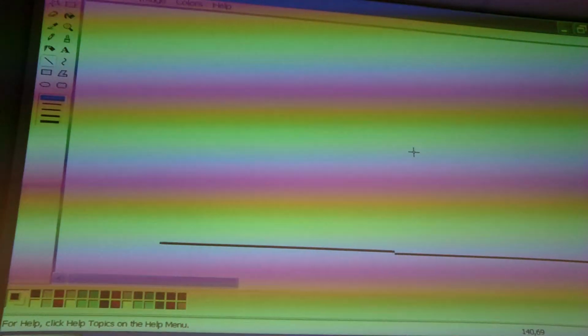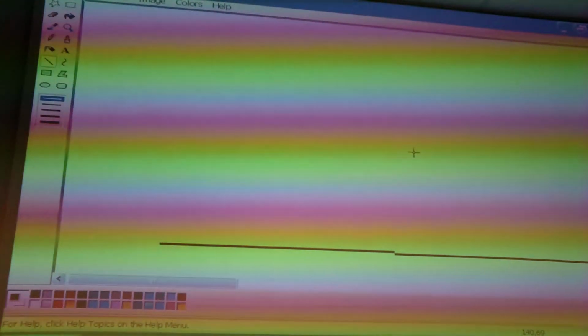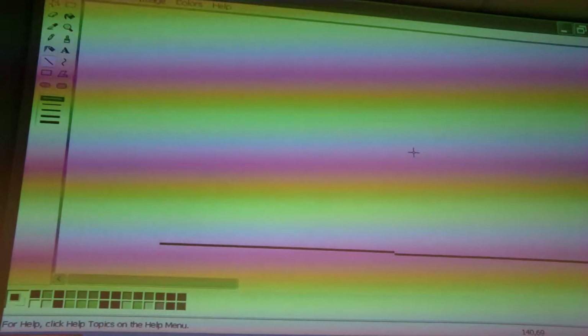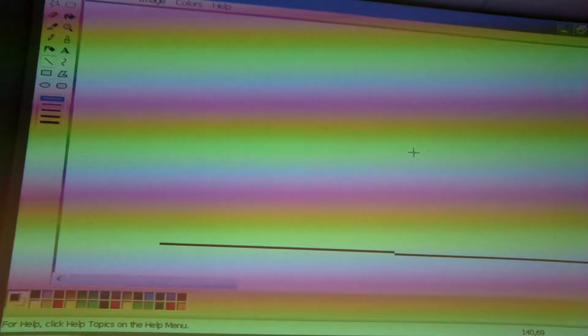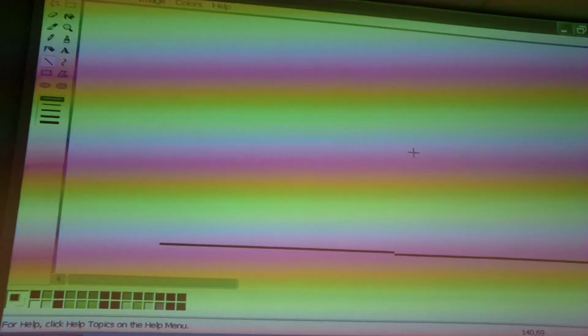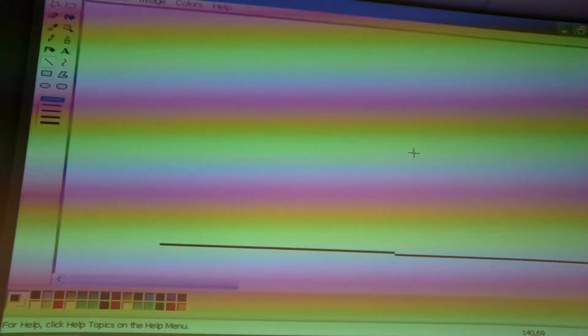You want to use a primary antibody, okay? So that would be a catching antibody. So what should we do? Shall we coat our samples directly, or shall we use a catching antibody? If you want to detect a specific antibody, you would coat with an antigen specific for that antibody, to capture it. But we want to measure at first all the human antibodies, and then a specific antigen doesn't help you, so you have to choose an antibody that captures all the antibodies. So you see, all the sample is useful to coat, basically.